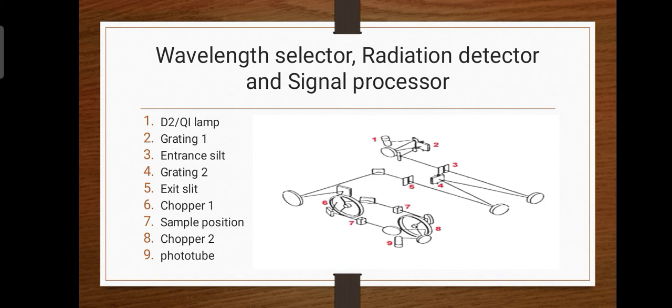So the phototube detector first corrects for any residual signal in the detector by zeroing itself during the moment when the black section of the chopper blocks the light beam. So next, the sample and reference beams are sequentially measured.